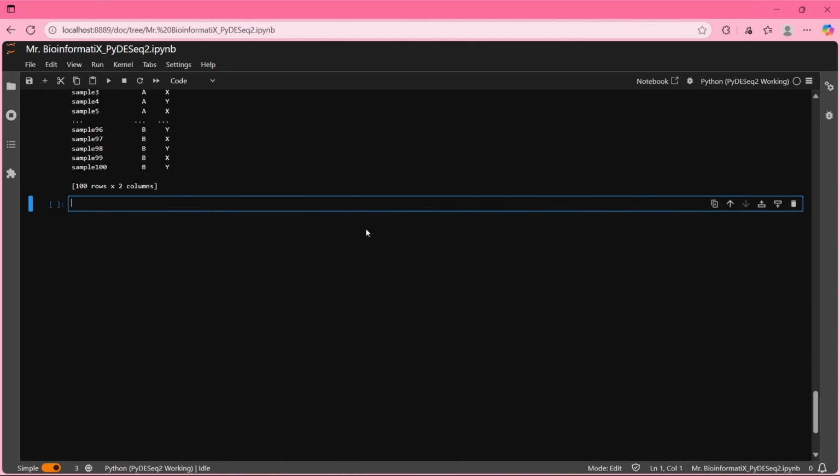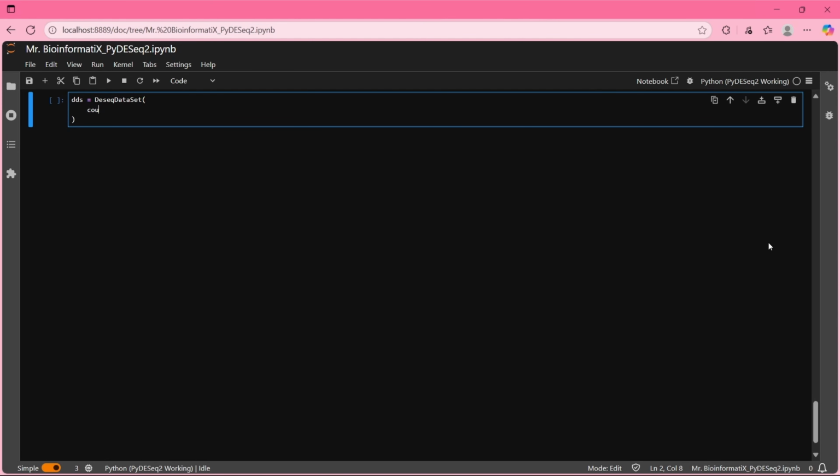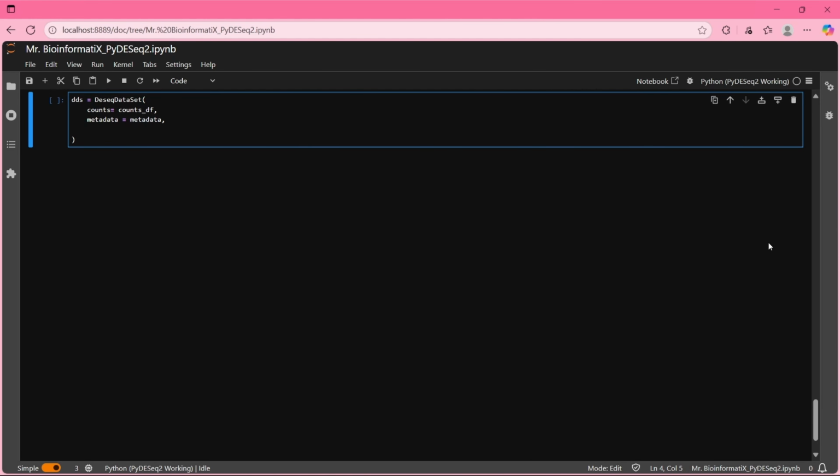So we put group plus condition. As you remember, before it was just condition.